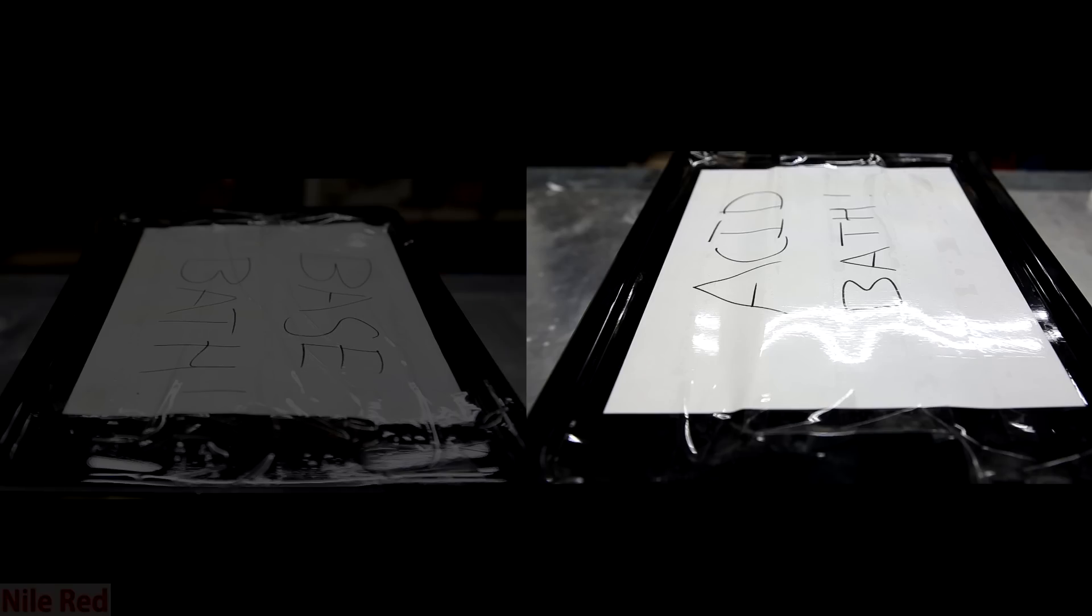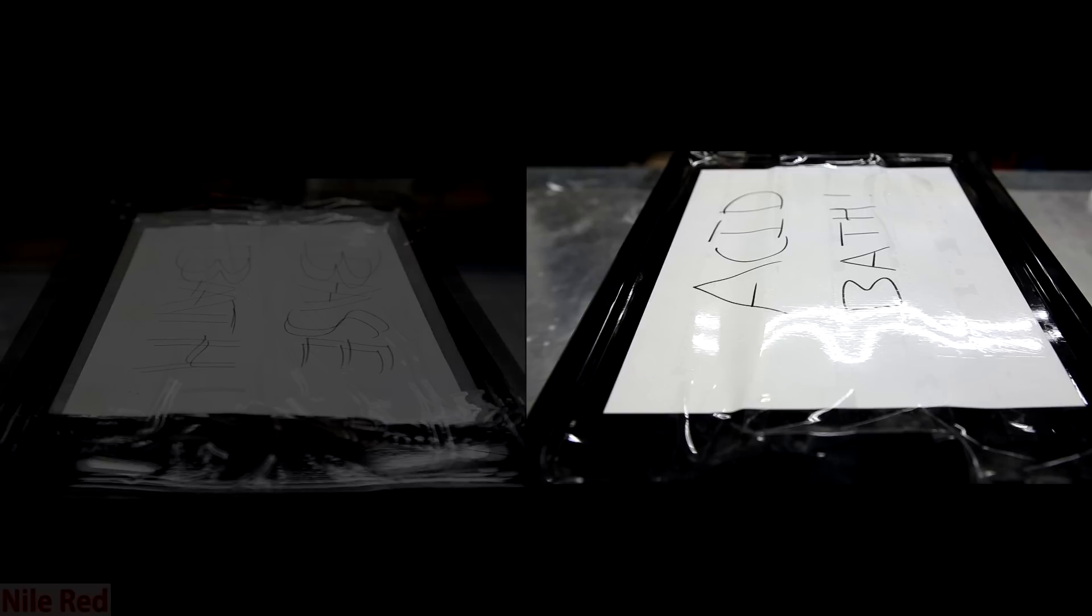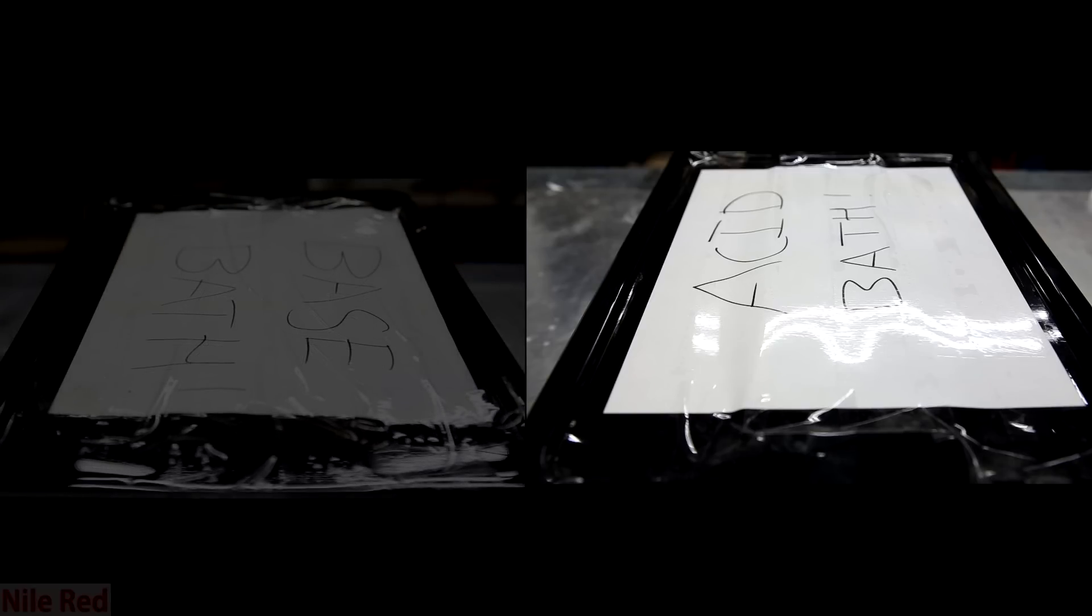The typical answer to the glass cleaning issue is by the use of a base bath and less frequently an acid bath. Generally the acid bath is used to react with more inorganic compounds and solubilize them, where the base bath is more used to remove organic compounds.